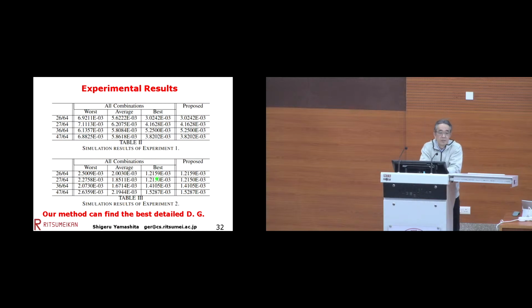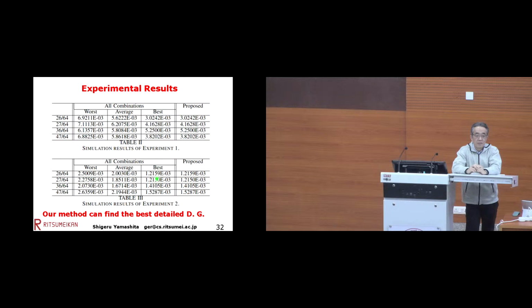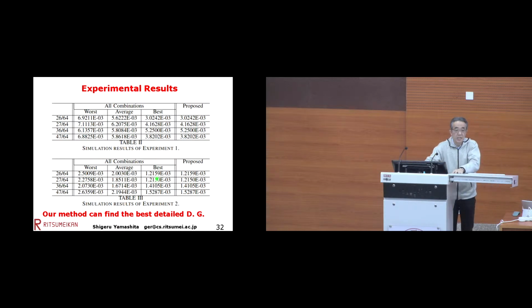Can the capacity for the mixing be increased instead of one drop? Can they add 2 drops, or is that not possible? When you mix drops, you take 1 drop and 1 drop for one chip. But can that be increased to multiple drops for mixing? So for this device, we cannot do that.